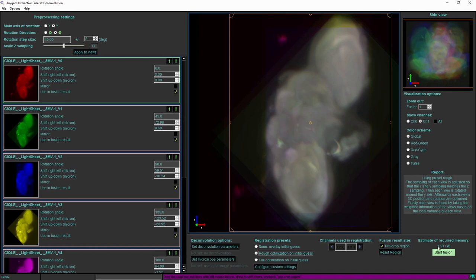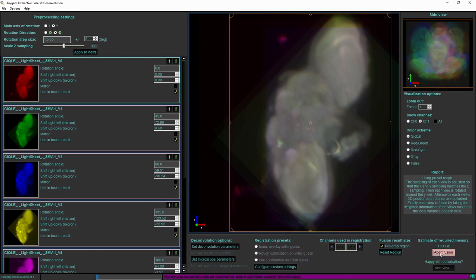Right on top of here it will give an estimate that it will take 1.21 gigabytes of memory to perform the fusion in this case. Let us start the process.